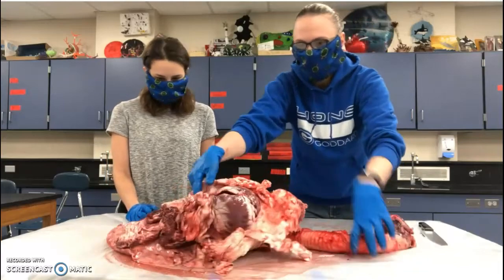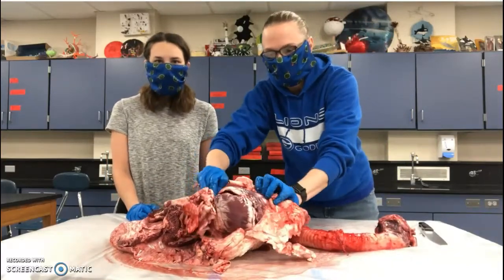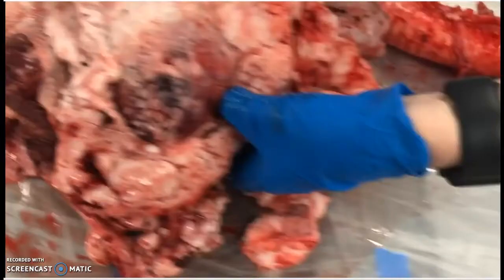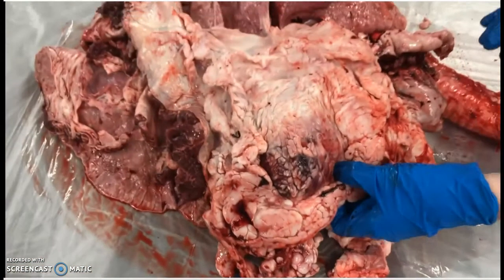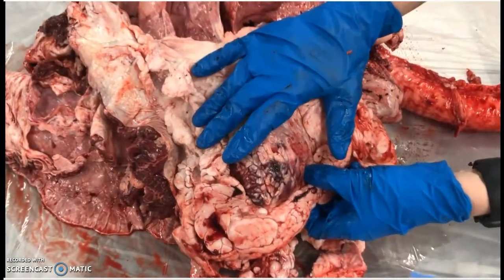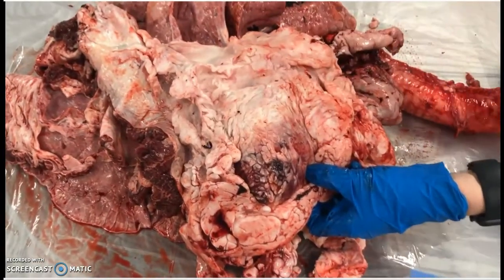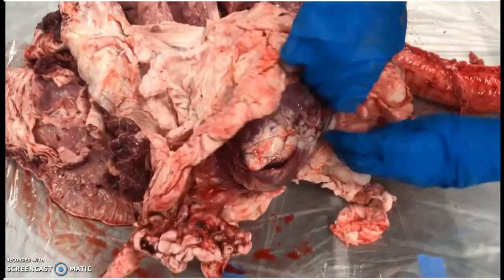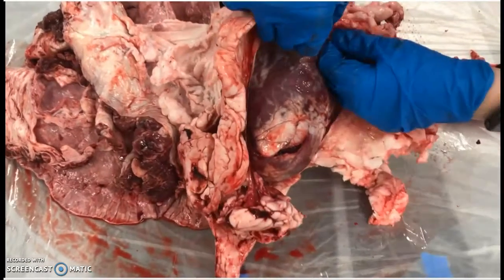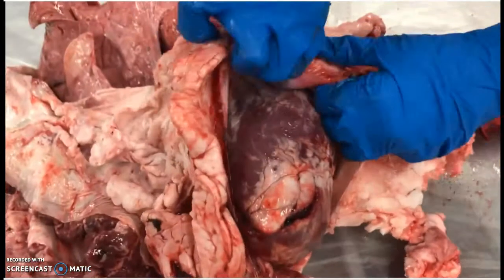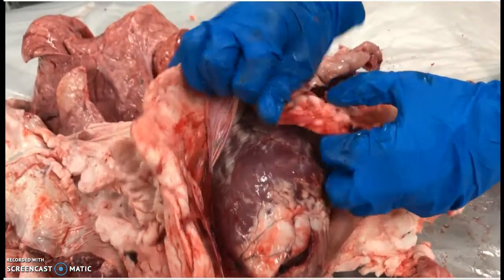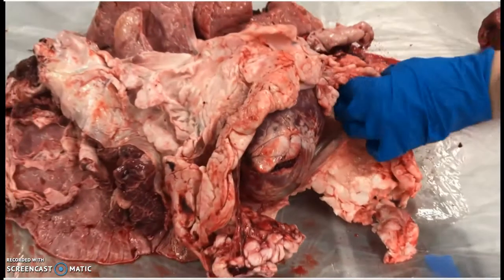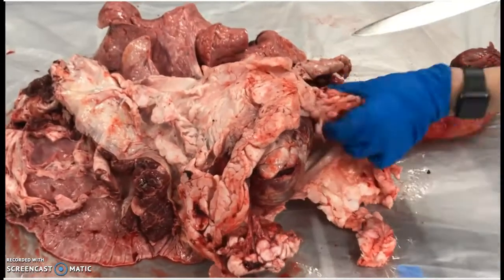So here is our heart. We're getting ready to reveal the heart. Remember, the sac that the heart is enclosed in is called the pericardium. So we've cut through the pericardium — that sac. It's a really tough and fibrous sac. I can't tear it with my hands — I'm pushing really hard and that pericardium is not tearing open. So it's a really tough fibrous sac that protects and surrounds the heart.